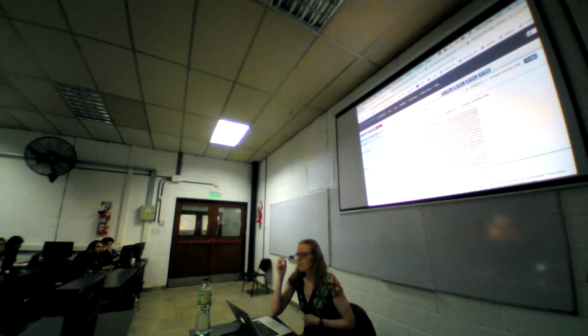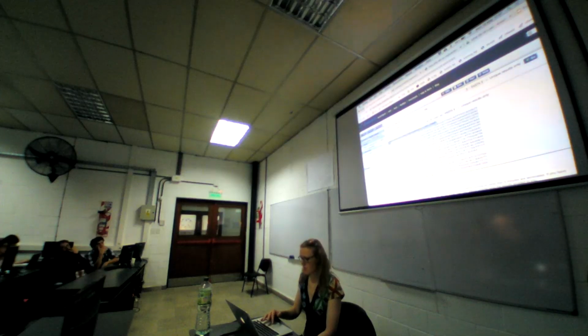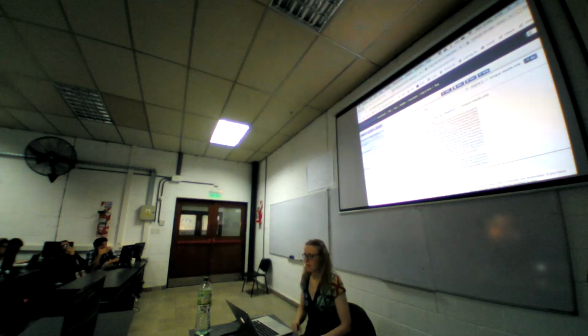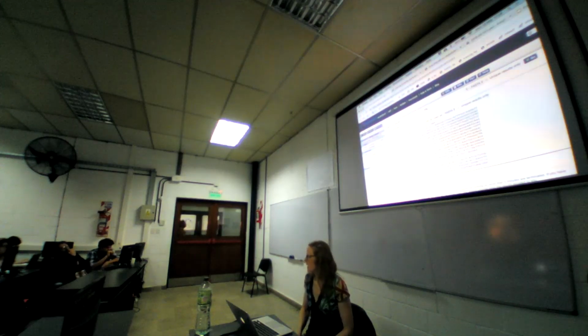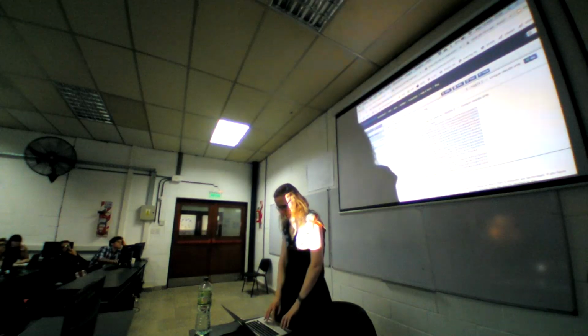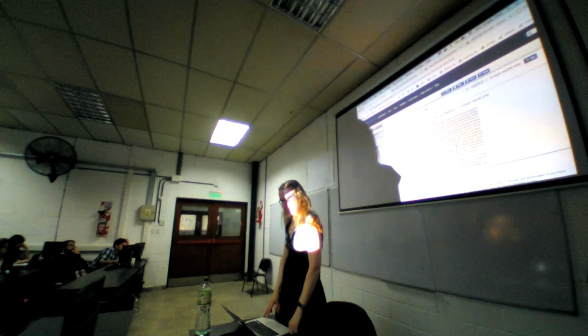And now you can see a preview of this big FASTA file, which includes all transcripts for all of these 6 genes. So here's one transcript for this gene, here's another transcript for another gene, and so on. So yeah, that's how you get tabular data and sequences with BioMart. I hope this is useful and saves a bit of time for you.